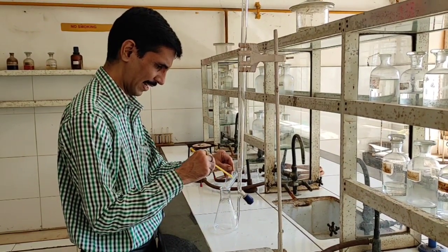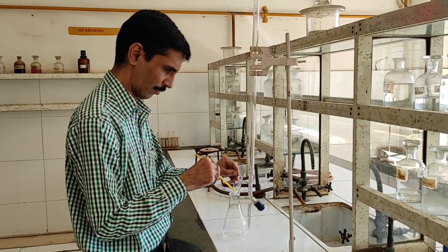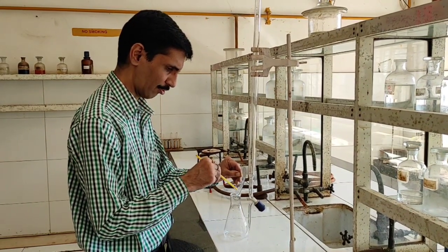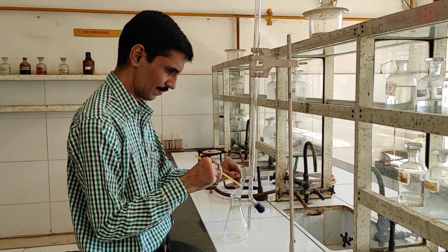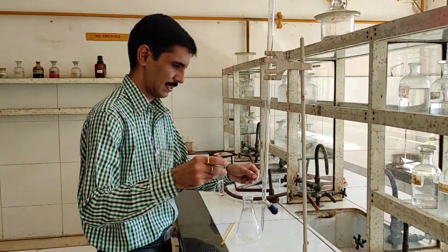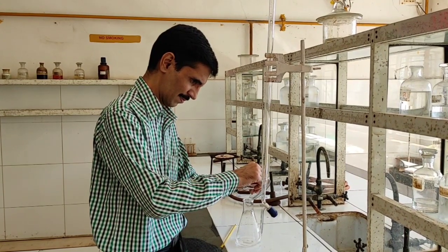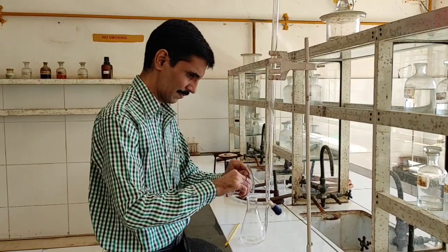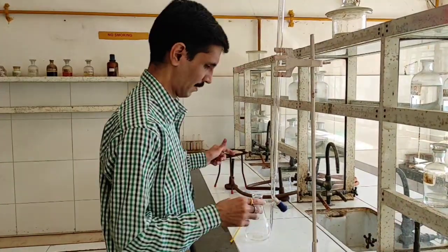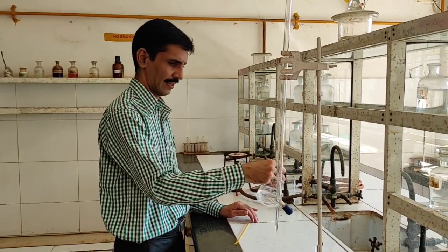I take in 20 ml exactly, but then purposely I have removed some amount of the NaOH from the 20 ml, so that I can use it for washing purposes of the watch glass, so that I want to make sure that the entire amount of 0.5 grams goes into the conical flask. So for that purpose, I'll be just giving some washings with the NaOH itself. Okay, so it becomes absolutely clear. Now it is being dissolved in NaOH.